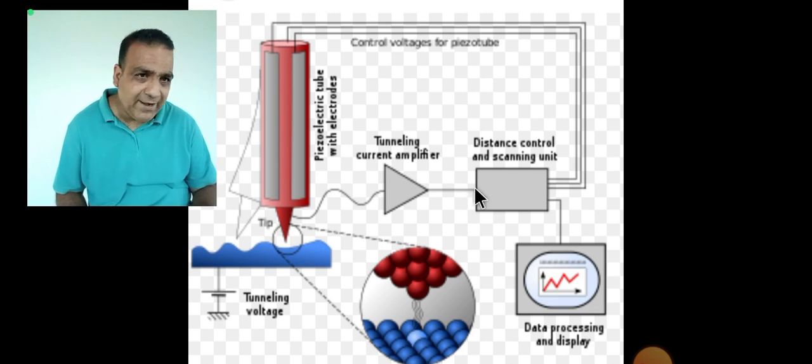The next point is that the probe is raster scanned across the sample surface, typically by a piezoelectric scanner, to collect the data points point by point.